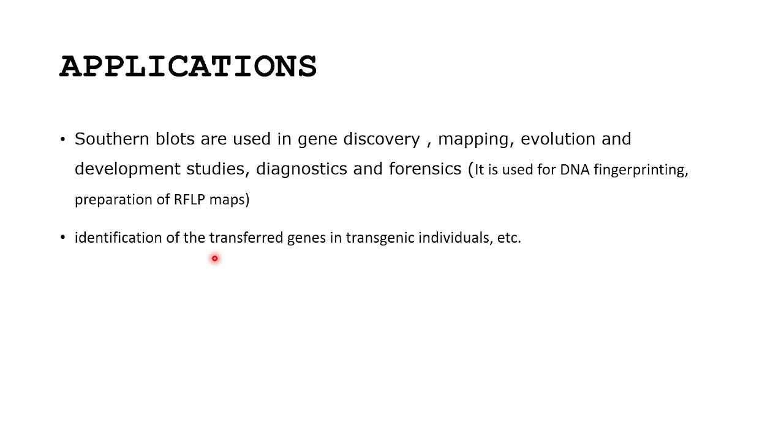So the different applications of Southern blotting include gene discovery, evolution and developmental studies. Then you have mapping, diagnostics, forensics. Also it is used for DNA fingerprinting and RFLP maps. Also you can use this for the identification of transferred genes in transgenic individuals.